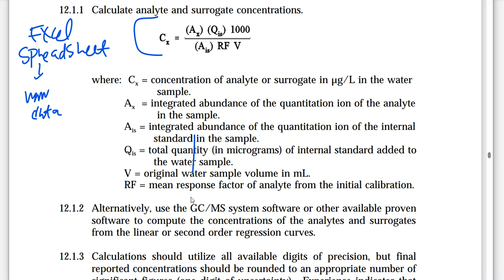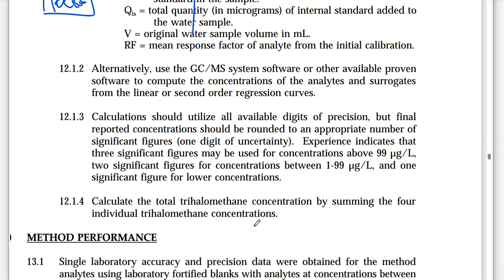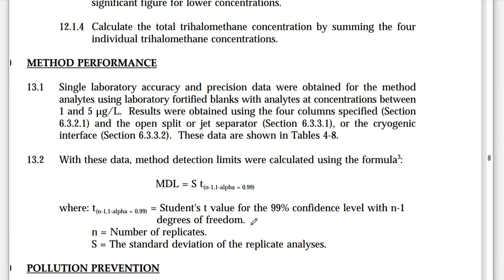So that way I just have to key in one number, and that is it. And the spreadsheet has already been validated. It already knows, yep, we're going to handle our data the proper way. And it locks you out most of the time of everything in the spreadsheet except the cells that you can actually key in numbers for. That way you cannot make accidental changes to the spreadsheet, which will then modify or give you wrong results for a reviewer.